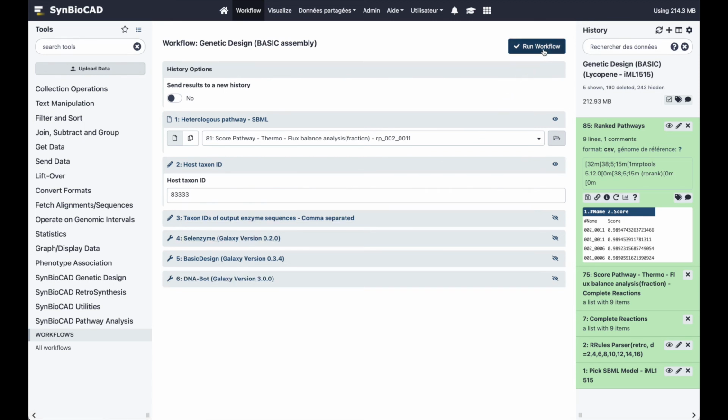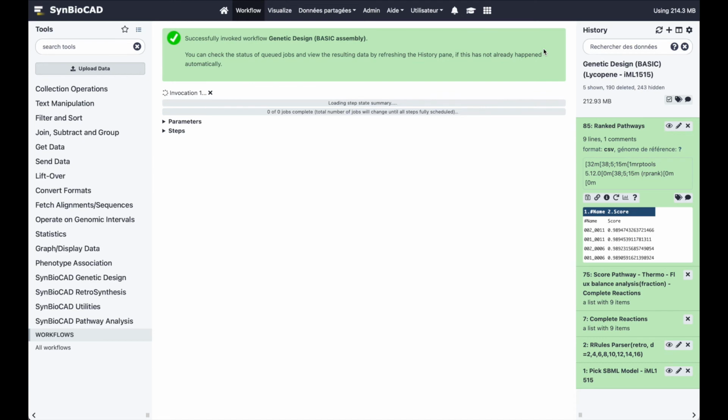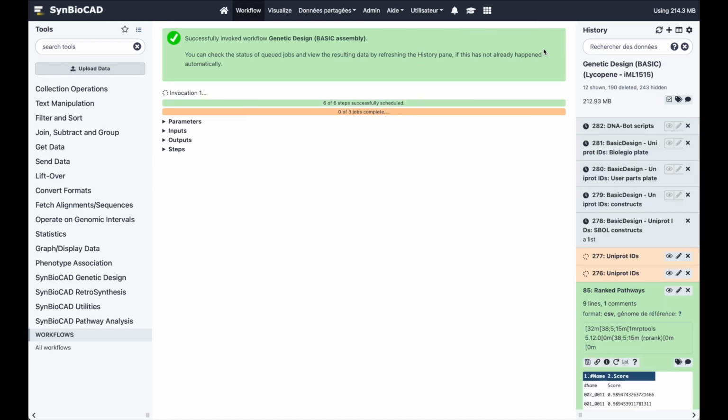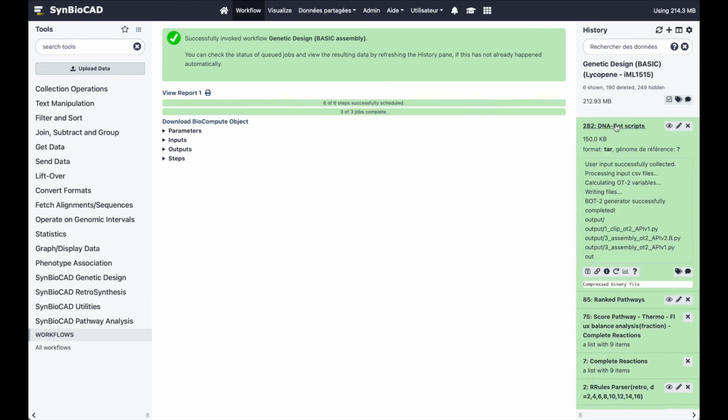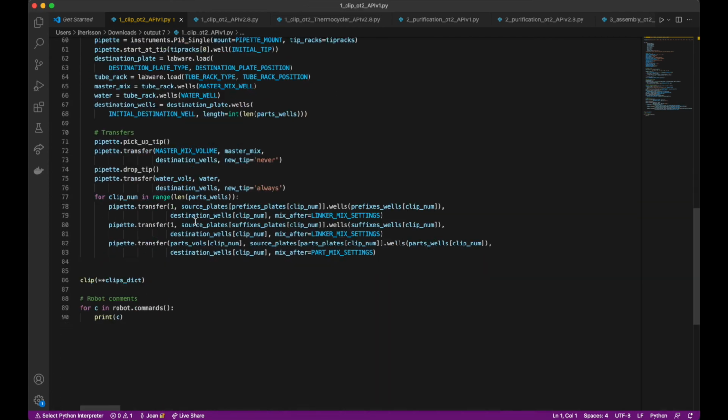Okay, so we can click now on Run Workflow and see its execution in the history on the right panel. At the end of the execution, one gets Python scripts that can be used directly to pilot the OpenTrons robot. The scripts can be downloaded and viewed in a code editor.